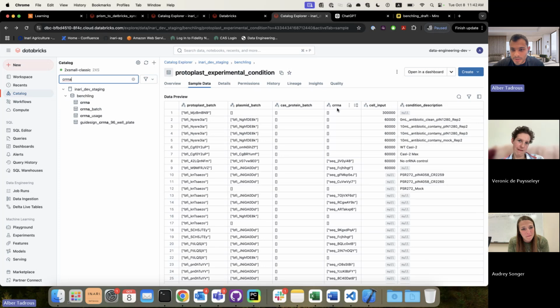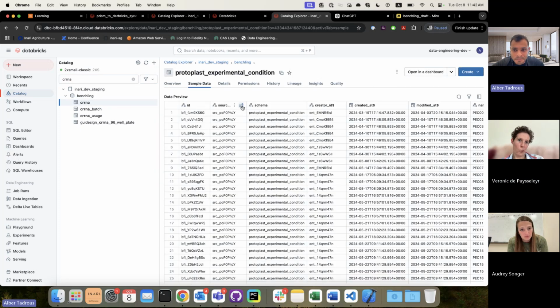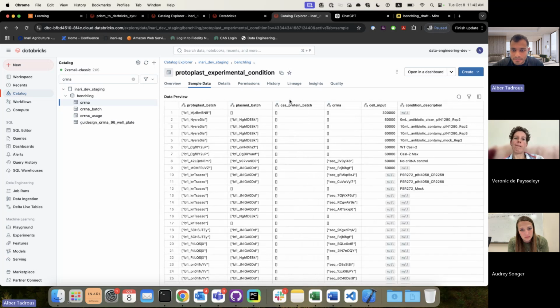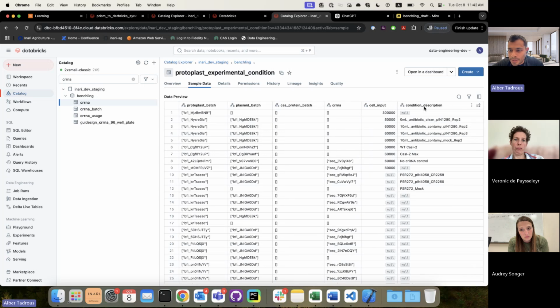Okay, so this CRRNA goes to guide, Cas will go to nuclease batch, plasmid will go to plasmid batch, protoplast will go to protoplast batch. Okay, and we'll include conditions. We include a new column. Let's call it, what, condition description. You want to copy it to the database?